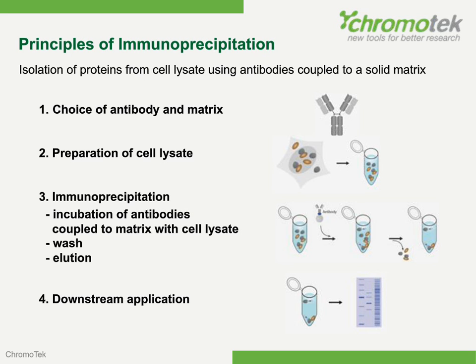So the principle of an IP reaction sounds very simple and straightforward. However, all of you who already did an IP know that there can be many pitfalls during such an IP. So now let's start to have a closer look at the single steps.